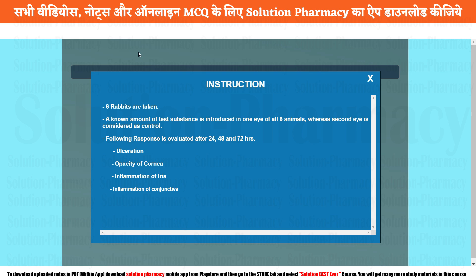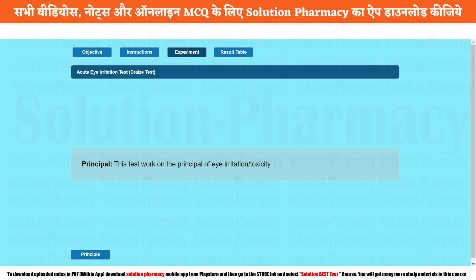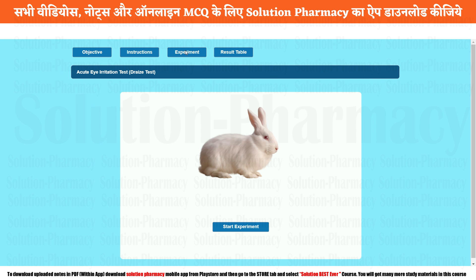The next tab is instruction, which gives the basic instruction and procedure. This is a very simple and short experiment; you can take a screenshot of this part if needed. Then close it and come to the main section, which is the experiment. For today's experiment, we are going to use rabbit as an experimental animal because it is very easy to handle and the large eye size will allow us to observe the response of the particular drug.